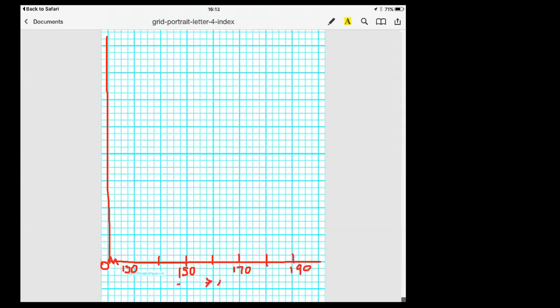Now, if you look at the undiluted acid, this is the volume of the undiluted acid that you have taken. In this case, obviously, I can start with 10 ml, or because we are not using 10 anywhere, let me start with 15. Let this be 20 ml.